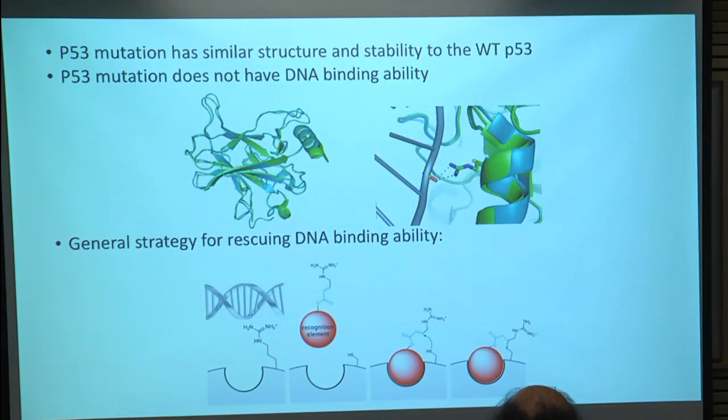As Chris from my group previously mentioned, we're using a covalent compound to do that. We're screening using LCMS, and I hope that with the structures that I sent for this workshop, we will be able to see more insights into the binding of the compounds that we have, and further improve our recognition element and our activation of the compound.